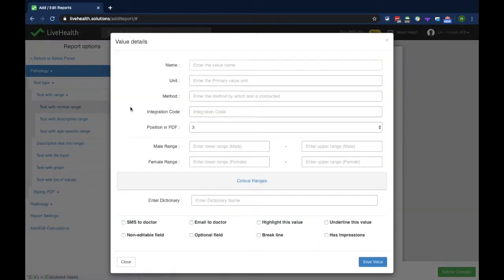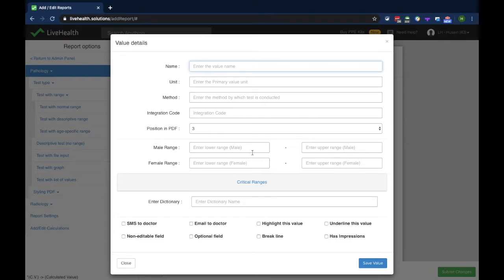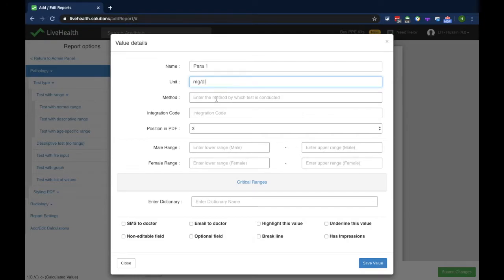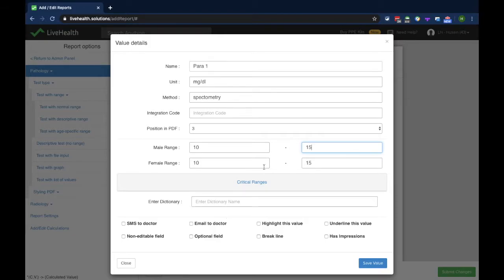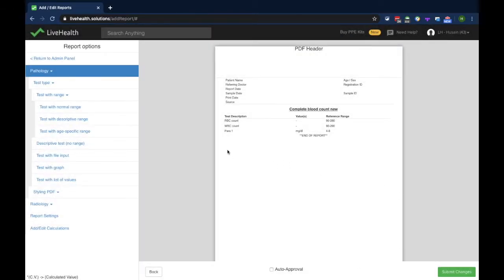Test with normal range is used when you want to create a parameter where the normal ranges do not change with age — throughout all ages the parameter reference range remains the same. You set the unit, for example mg/dL, and you can keep the male and female range the same or change it if you want. Click save and the parameter is created.